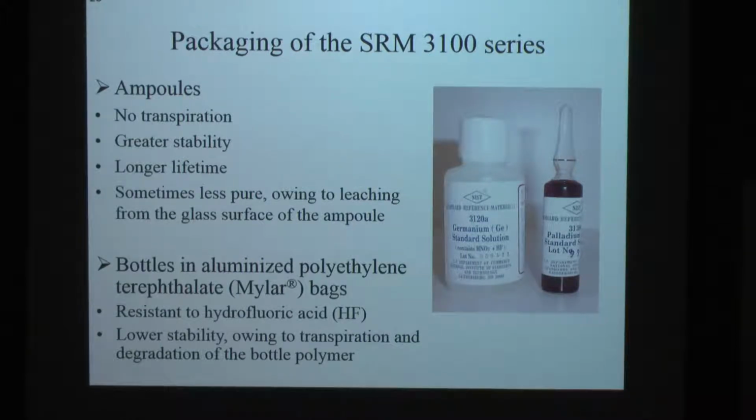If you put, like, 1 mole per liter nitric acid in a polyethylene bottle, put it on a shelf and go back 20 years from now and then empty it, you may squeeze the bottle and it crumbles in your hands. We've seen that happen.